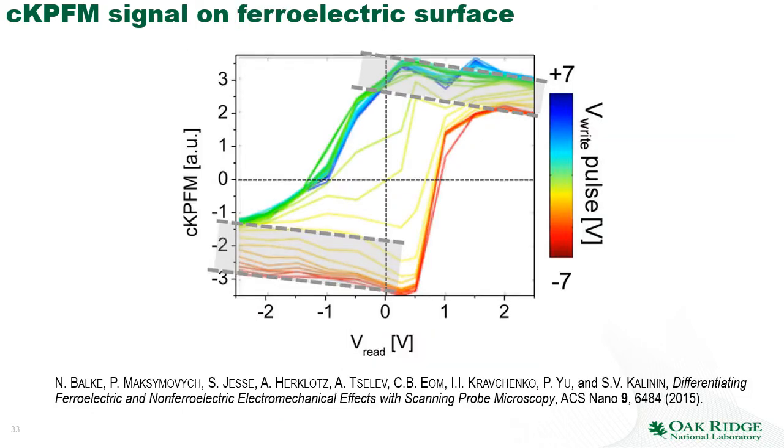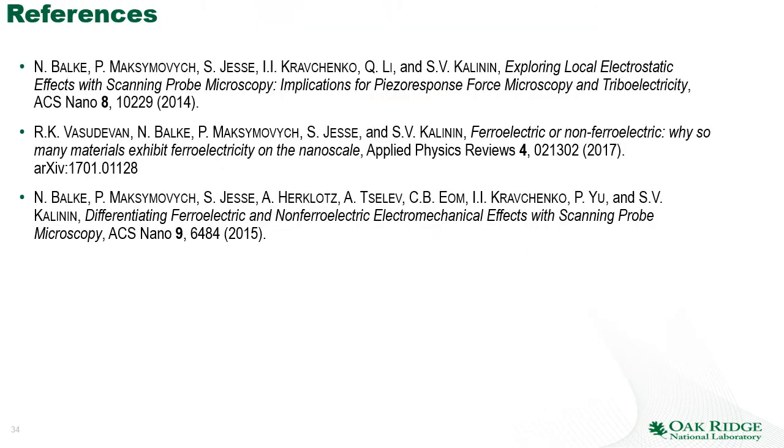For the time being, our effort has been focused on exploring ferroelectric materials for CKPFM, in which case we detect primarily the ferroelectric loops. But as I said, this is an area which can be of extreme interest for classical ferroelectric and non-ferroelectric materials, oxides, semiconductors, solar cells, and so on.